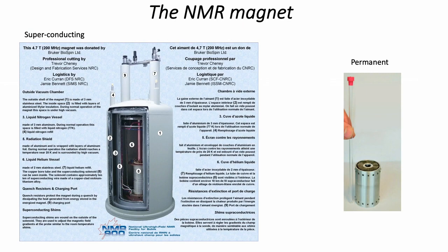So the magnetic field is generated by the circulation of electric charge in a superconductor. And if you're familiar with superconductors, usually they have to be below some specific temperature in order to maintain their conductivity.